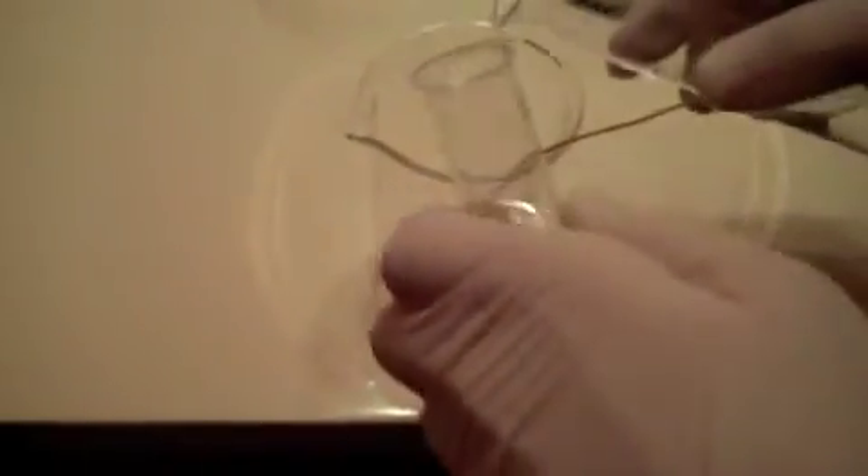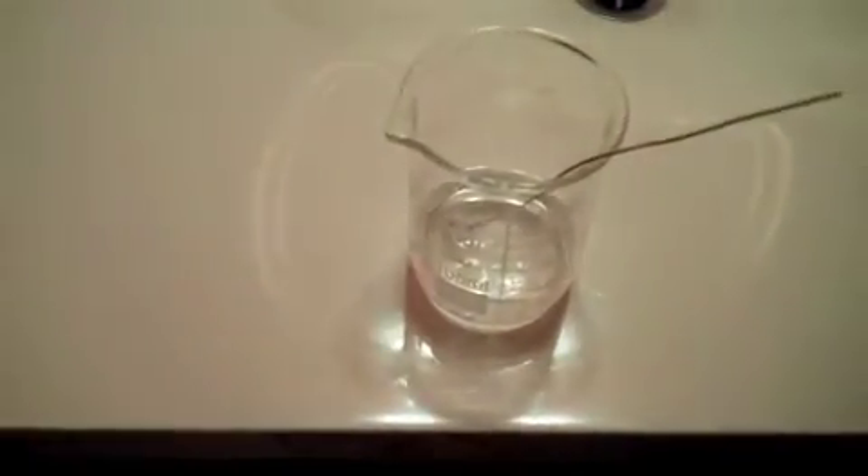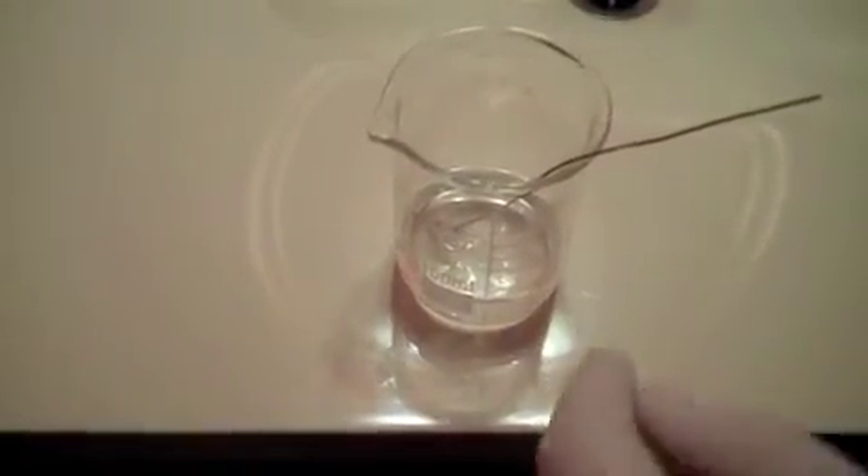This is where the fun begins. Turn off the lights. That's it — it's foaming, that's good. That's why they want the copper wire. It's glowing! Pour in there — that's better. Oh my gosh.